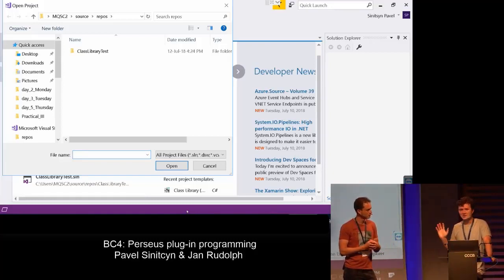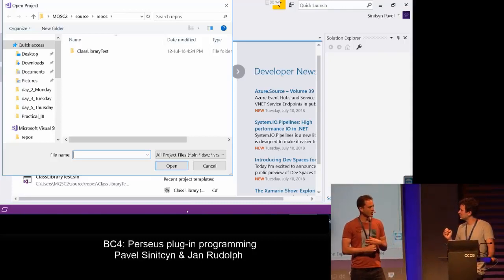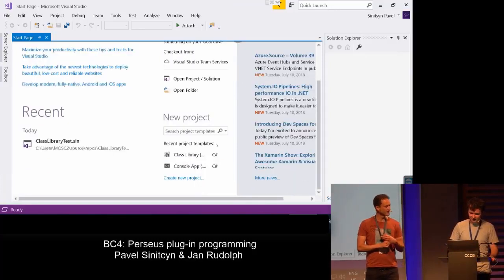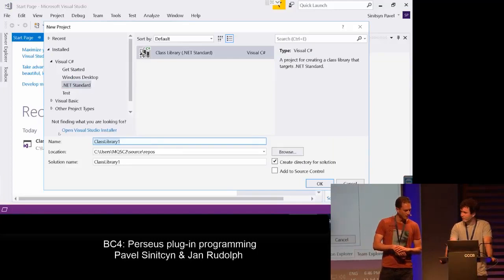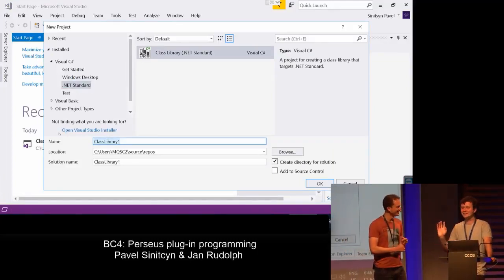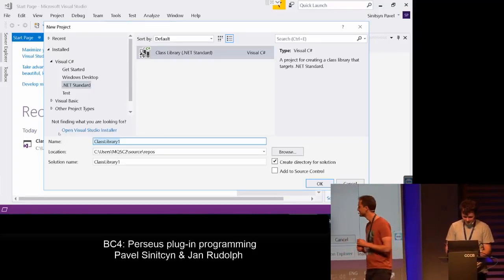Of course, you understand this is a sandbox, it's nothing super. I think it would be a good start to just do something with the matrix. So let's create a new project. How do we name this project? I think we should be descriptive. I will make something, and Jan will tell me whether it is correct or not. Okay, let's see. So it's first row provider. No, it's too long. First rows.